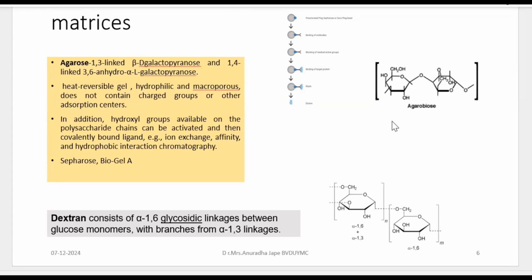All right. So the chromatographic column should be a stable, inert one. It is also provided with an inlet and outlet. For loading the sample, you have the inlet, and for elution, you have the outlet. Then you have to attach certain adapters to it for eluting the sample from the column. So such arrangements are there. The standard column, how it looks, we have seen in the previous slide, but a detailed photograph we will share as we go with the actual working of the column.